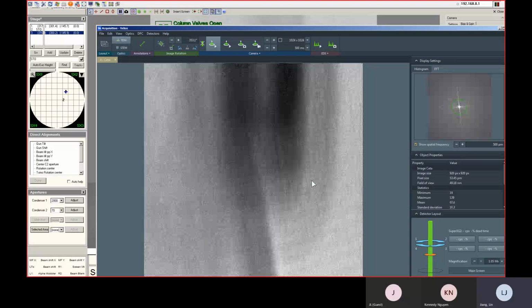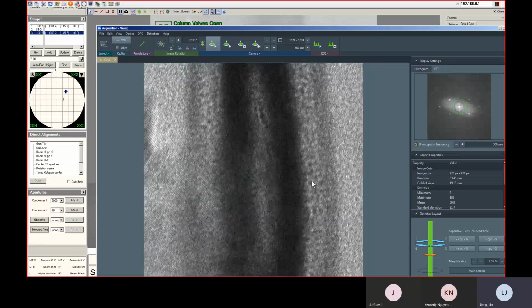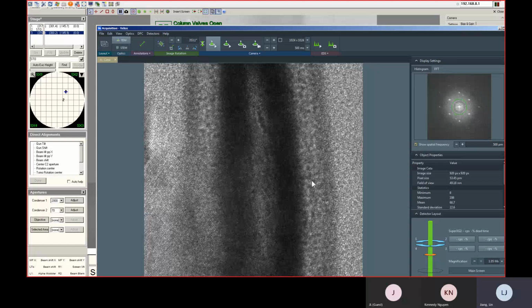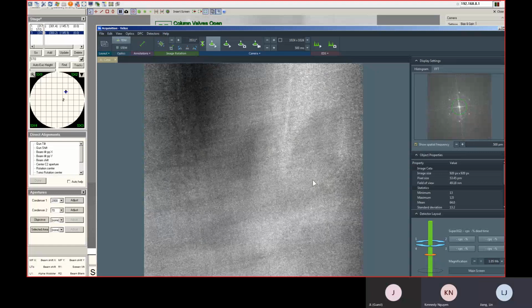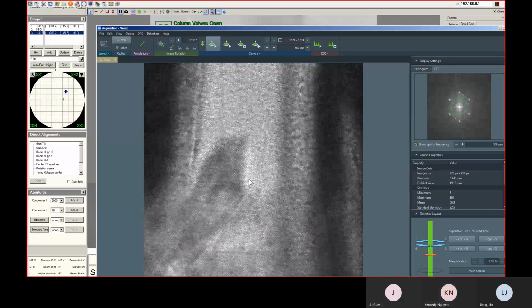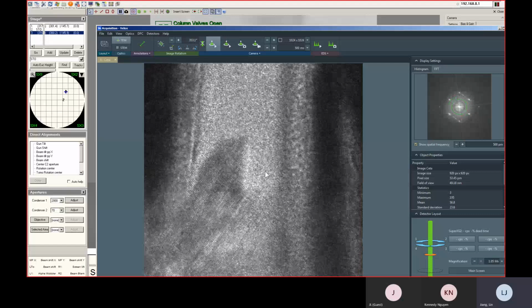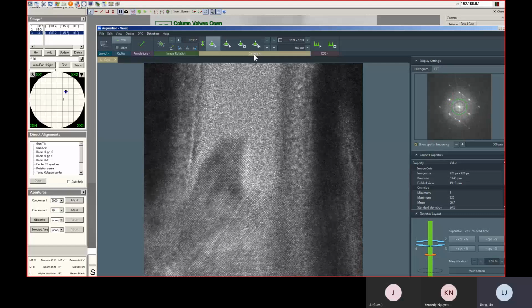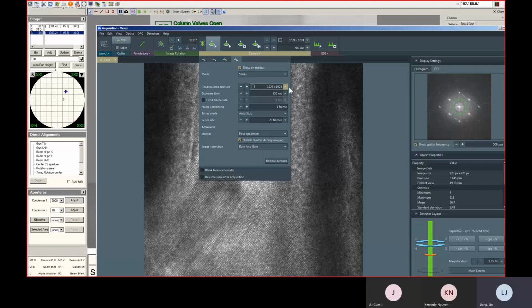For example, here this is a particle, and you're going to see drift. And here, this is a tiny crystal, something like this that drifts. That's usually what we run into. Yeah, I see. You can still do the DCFI. You see now we get a lot of drifting. You can set up reading.